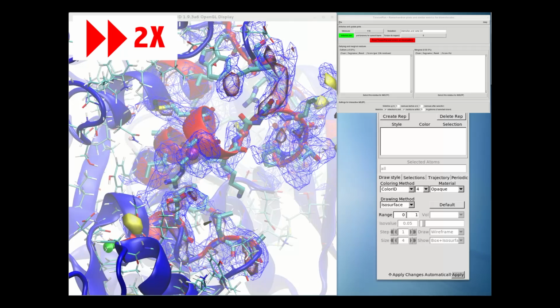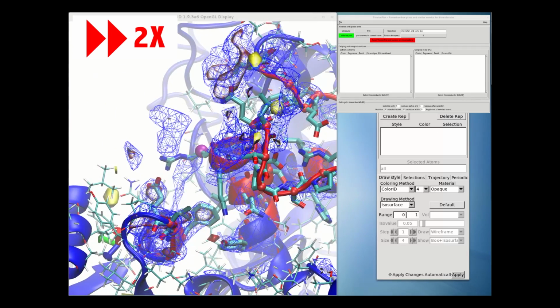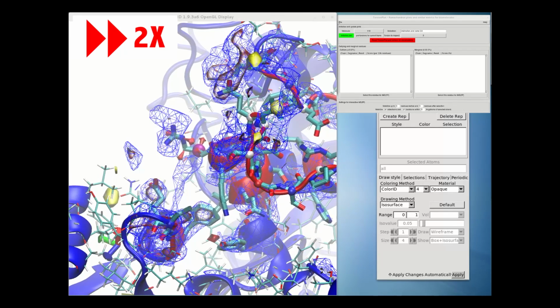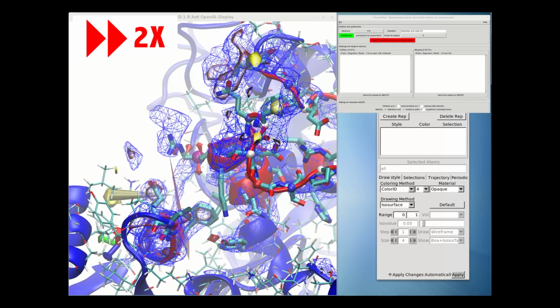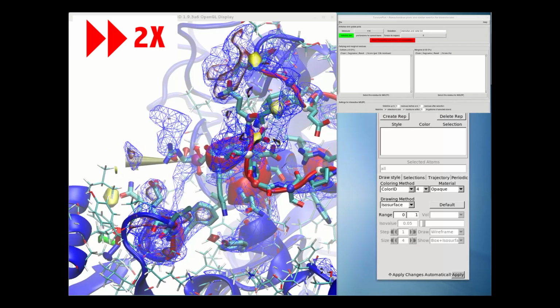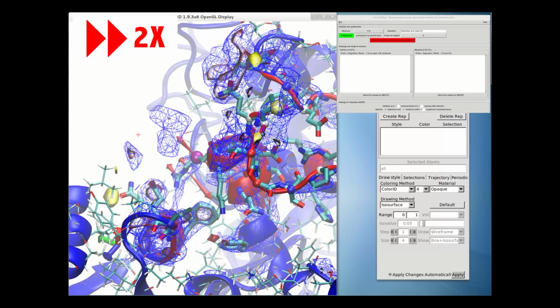Instead, once we've decided on a particular rotamer, this will be set as a target in dihedral space, and forces will be applied to guide the sidechain towards that conformation. I'm still tuning the force constants for this, but in general this should not necessarily be expected to get the sidechain there on its own, but rather to act as a guide to supplement manual interactions. Once it's in the chosen conformation, we can release these extra forces and let it settle naturally into the map.